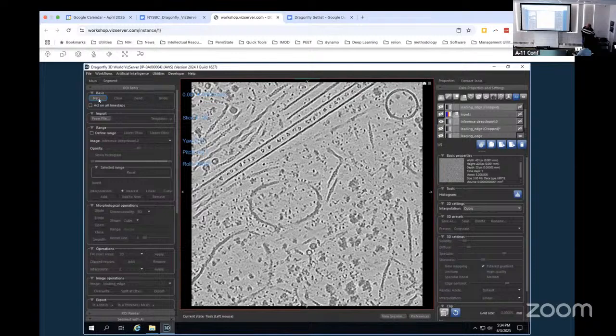And the way you build a region or an ROI is to just click this new button under the basic tools. We're going to give it a name. Call it ground or ground truth or whatever you want to call it. We're going to leave the geometry setting as leading edge. You want it to be the same as whatever tomogram you're making it on.